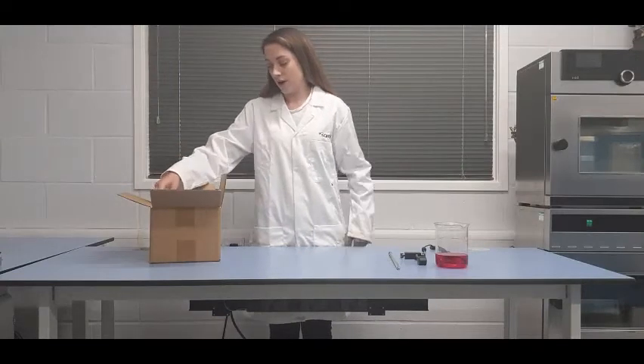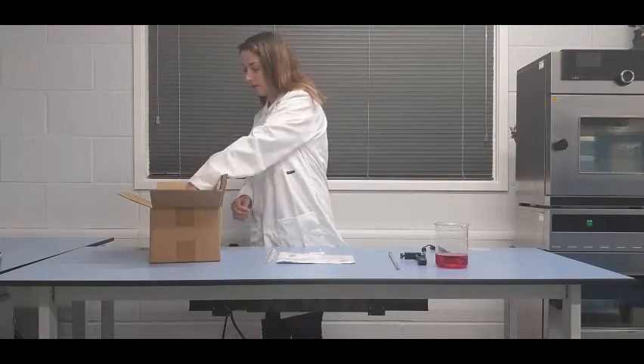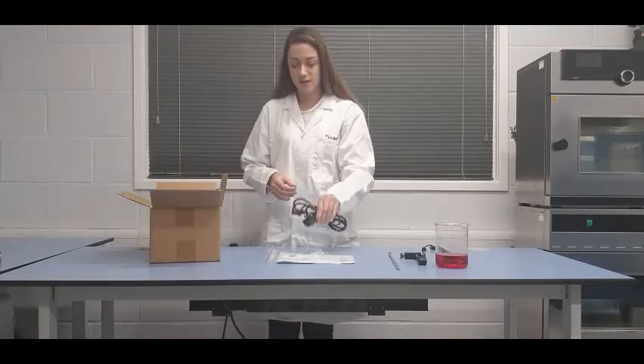Included in the box you'll find the magnetic stir bar, the instruction manual, the power lead, and this is along with the instrument itself.